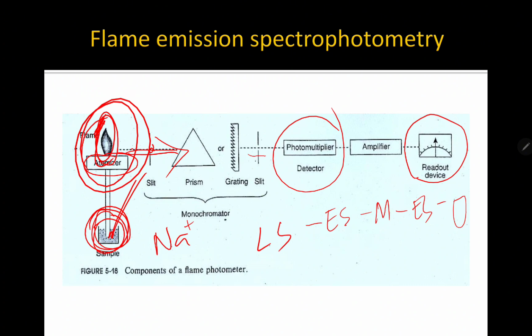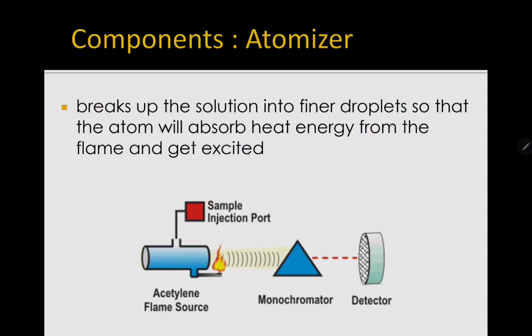Okay, so let's talk about the atomizer for a second. Okay, so your atomizer breaks up the solution into finer droplets so that the atom will absorb heat energy from the flame and get excited. Okay, so your atomizer, na kung saan yun yung nilalagay, nakatusok sa inyong sample, it will break up the solution into finer droplets so that the atoms will absorb heat energy from the flame and get excited.